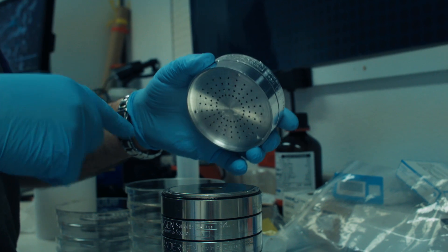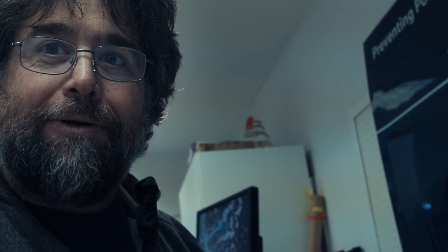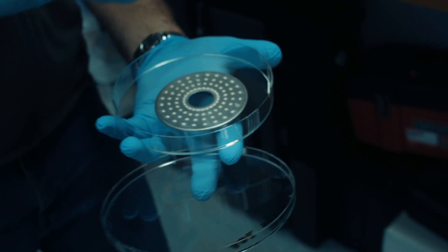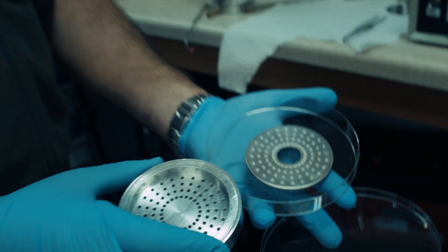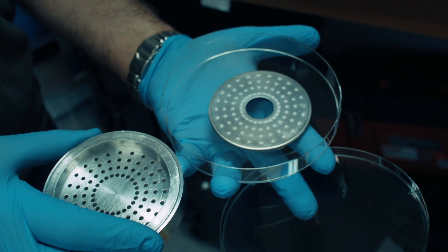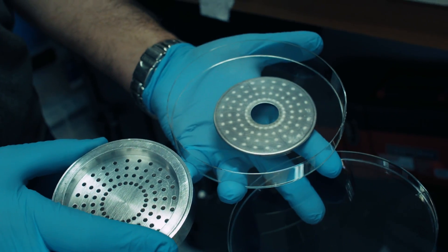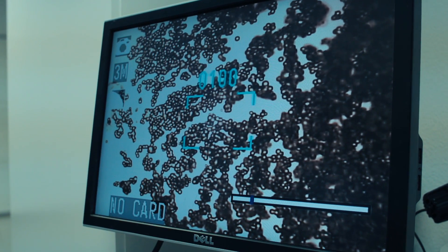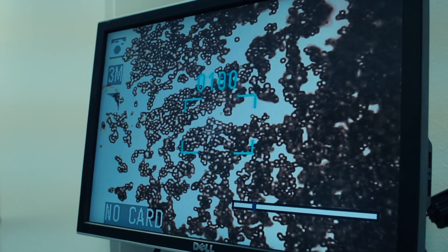It's like sorting coins in a coin sorter when you're a kid — the big ones stay at the top and the little ones go through. This is the plate we're most interested in, because this gives us the 10-micron cut underneath where those holes are. These are what we just made, looking at them on a microscope slide with a video microscope. Those particles look like they're about 9 to 10 microns. They'll come apart when you put them in solution.